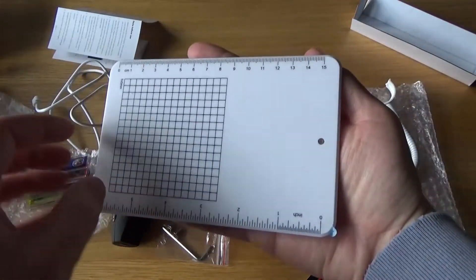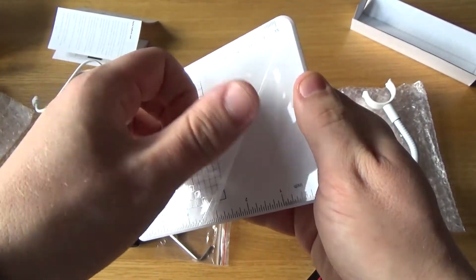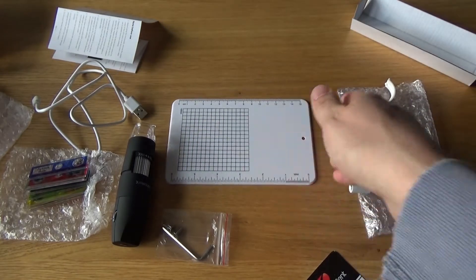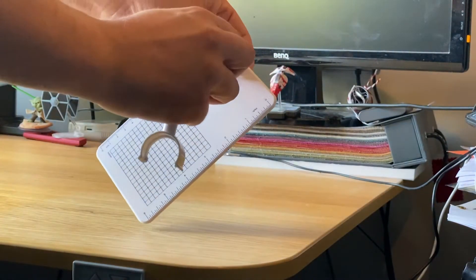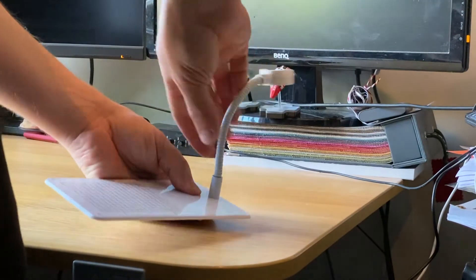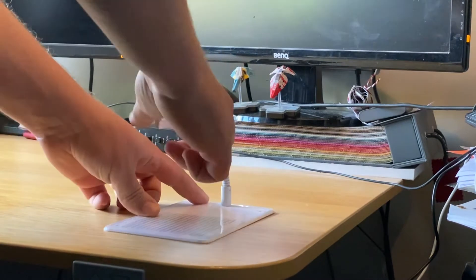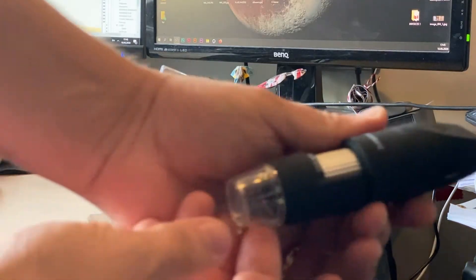It also comes with this little plate. You see the hole there on the right — peeling off the foil. You get the plate, attach the arm to it, get the little screw and tools, and you can put the microscope into it. It's a really simple procedure — you wouldn't even really need the screwdriver or the little tool they give you in the box. When you have the arm, you can adjust it to sit above the plate, then get the microscope and slot it in place.